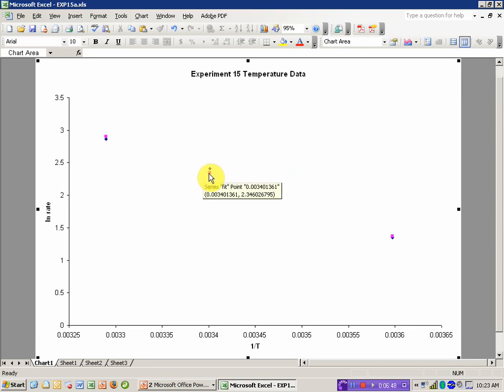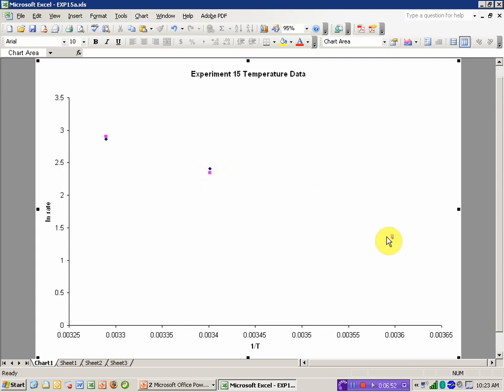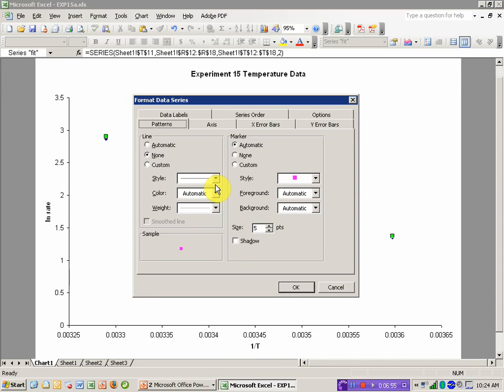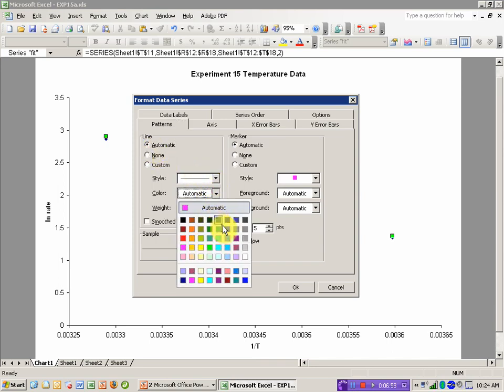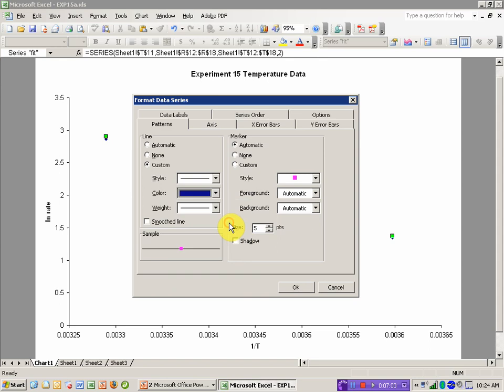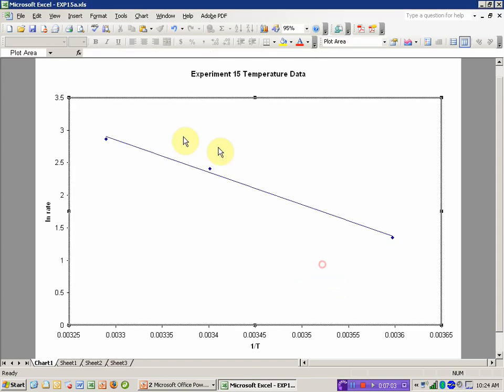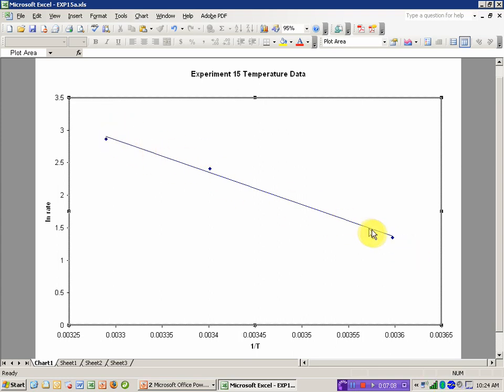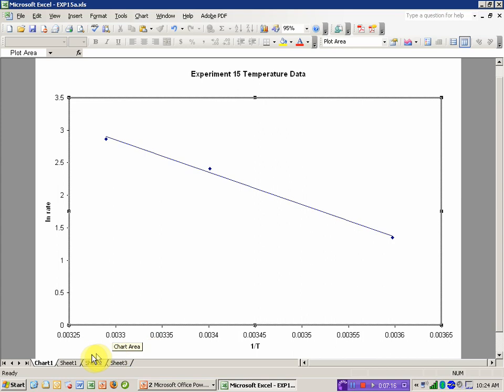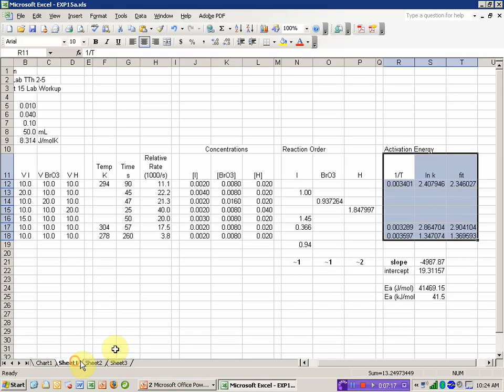And there's my data. I'm going to select and delete that gray background because it makes it a little hard for me to see. Now, this blue data was my raw data, and the pink was my fit. Recall that data should be points with no lines connecting them. And the fit should be just a line with no points. The data has points because it's actual measurements. The fit is an approximation of what the real values would be in a continuous area over that curve.